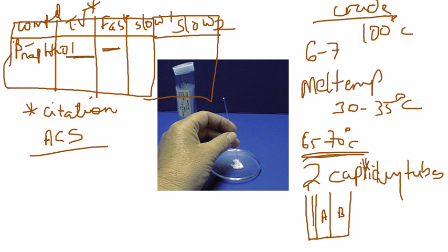So one of them is a thermometer probe. That's a thermometer probe. And then there are 2 other spots. You can put both of your slow readings together at the same time and do the slow heating. For slow heating, you should maintain no more than 2-degree change per minute.